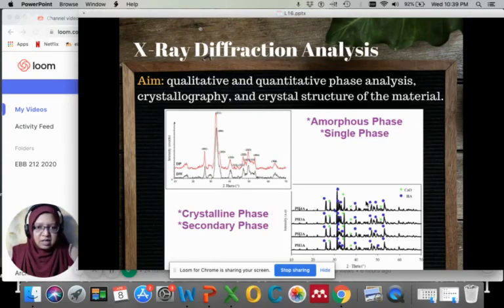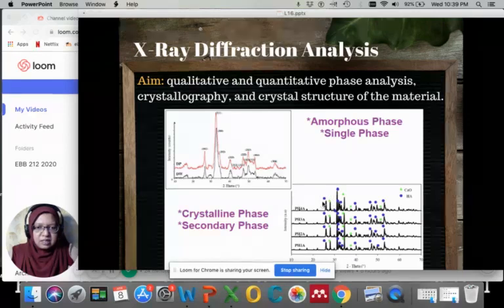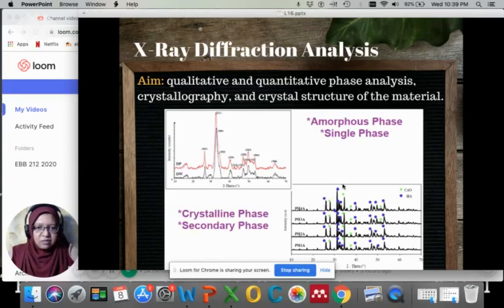However, as you can see, there are blue and green dots on the diffraction peaks. This shows that there is a secondary phase detected in the sample.